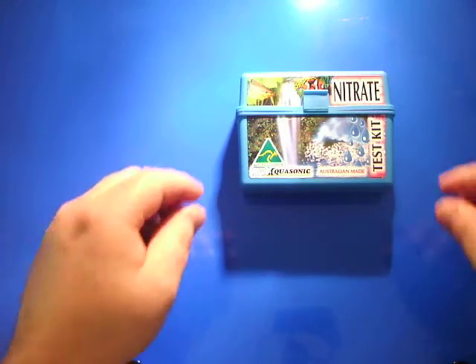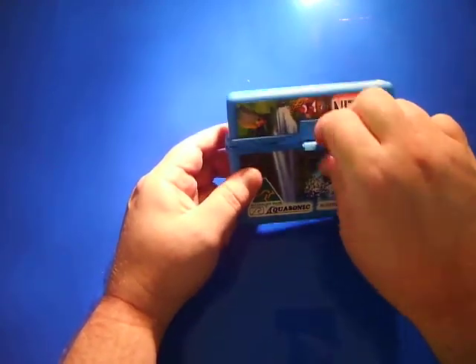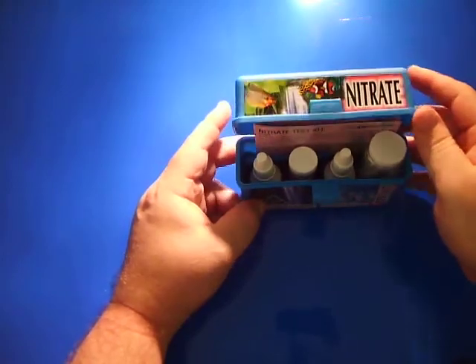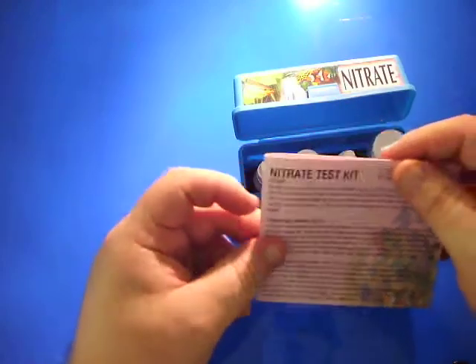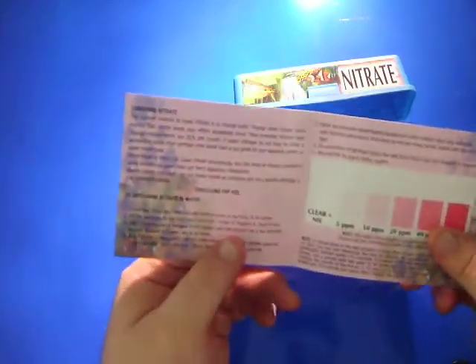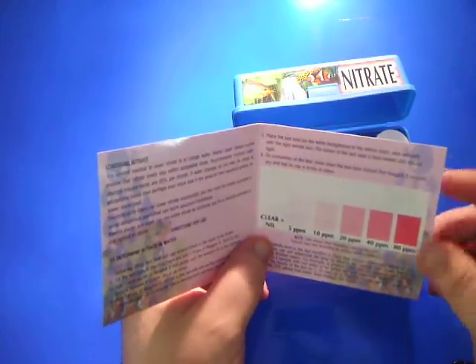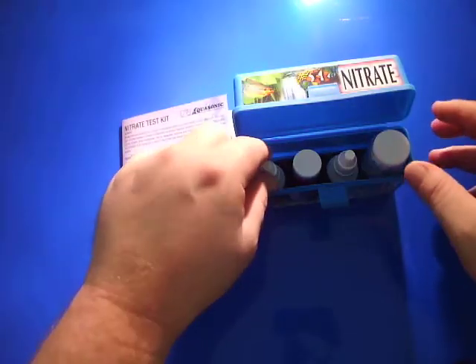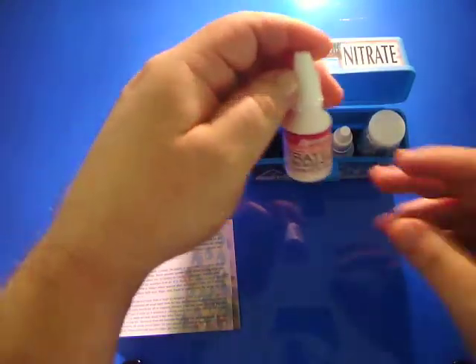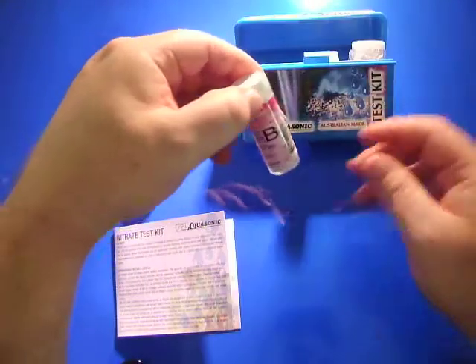Now this test kit is a good one — it's plastic, so it keeps the water off and you don't end up with a soggy box. When you're working around water you want something like that. The user guide is nice and easy, and it's laminated, so if any water gets on it it's not going to be destroyed and the manual is easily read.